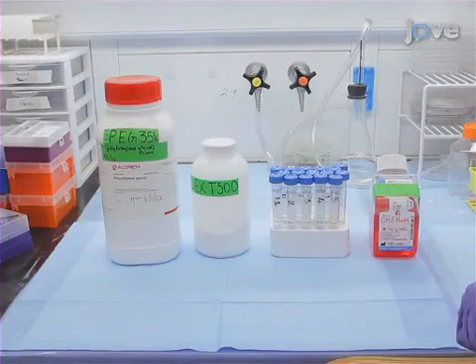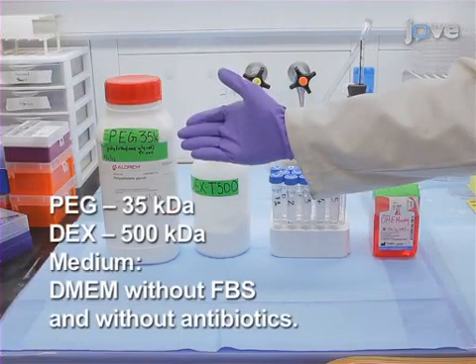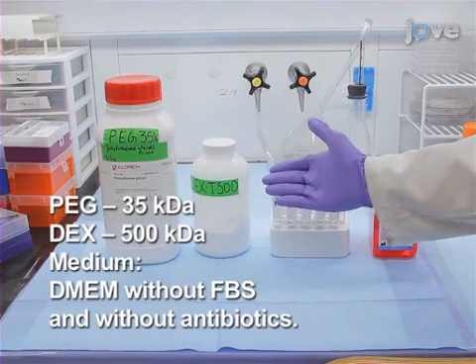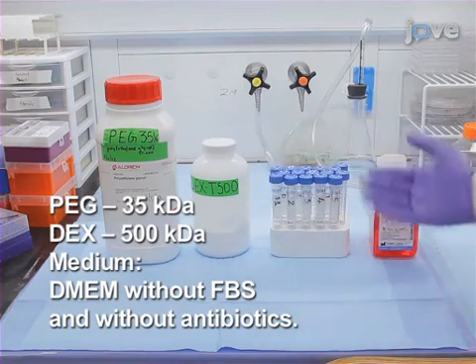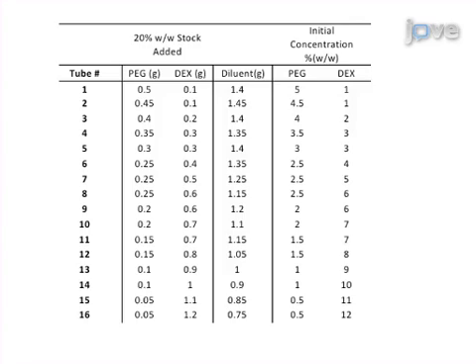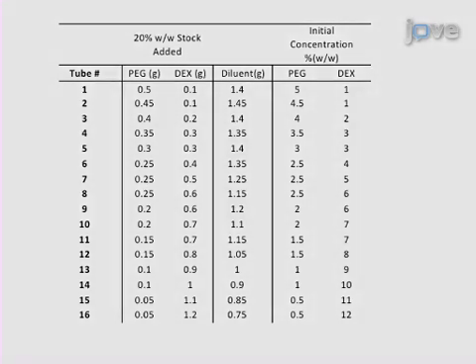Begin by dissolving the two different polymers into the specific medium that will be used in your experiments. In this example, polyethylene glycol, also known as PEG, and dextrin, also known as DEX, have molecular weights of 35 kilodaltons and 500 kilodaltons, respectively. Prepare 16 2-milliliter samples in 15-milliliter conical tubes, each with different concentrations of PEG and DEX.